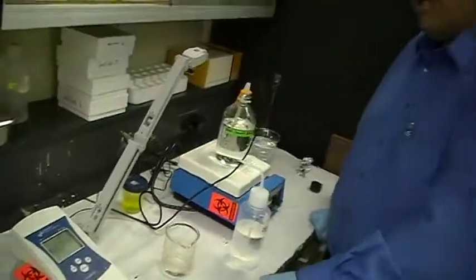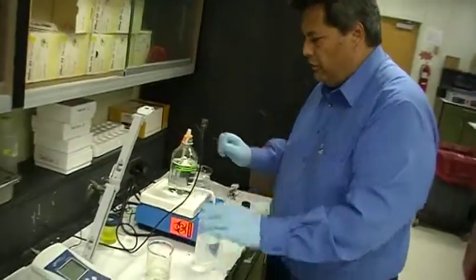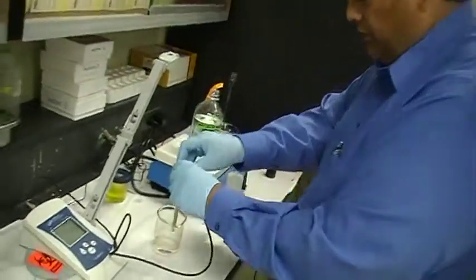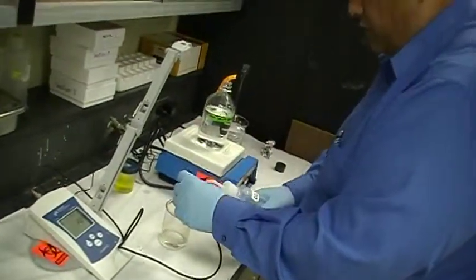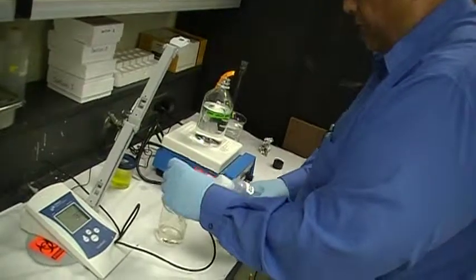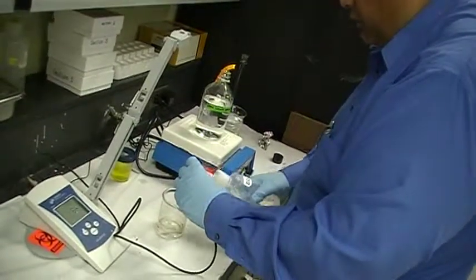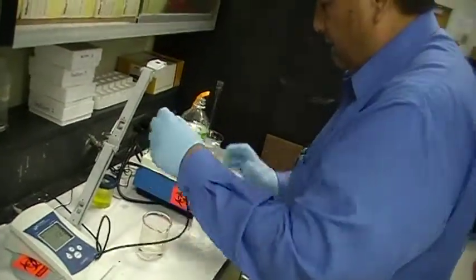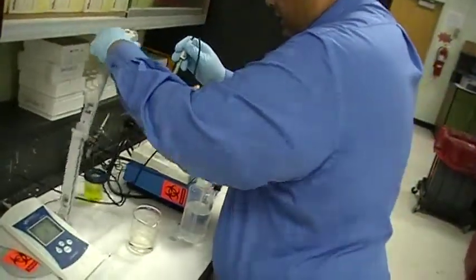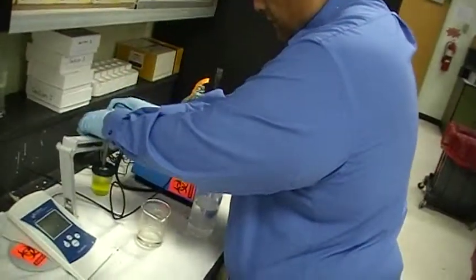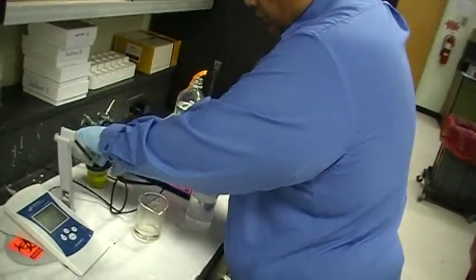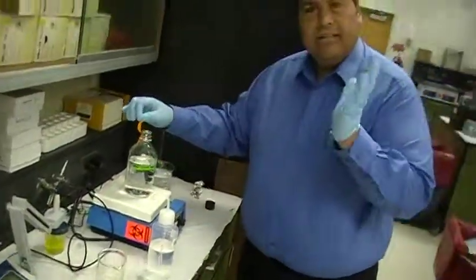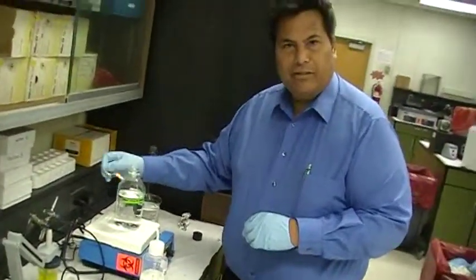So that's how you use the pH meter and when you finish, take it out of your buffer. Again, you provide this for washing. So rinse it off very, very thoroughly with deionized water using this squirt bottle and then you put it in the arm and you store it in the storage either standard solution or potassium chloride solution. And that's how we use the pH meter. Thank you.